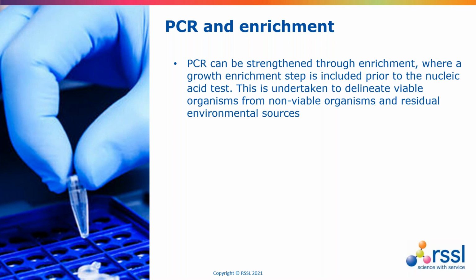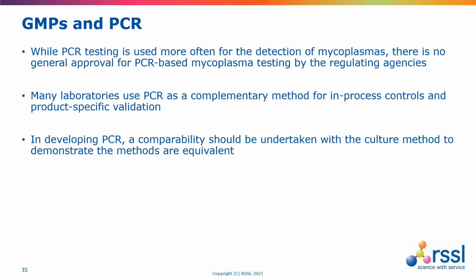But as things stand, the pharmacopoeia focuses largely on the culture method, and that still stands as the definitive test. But both US and European pharmacopoeia allow for alternative methods to be used. So you will get laboratories that are running both methods or may have obtained sufficient validation data to switch to PCR and obtained agreement with the appropriate regulatory authority.